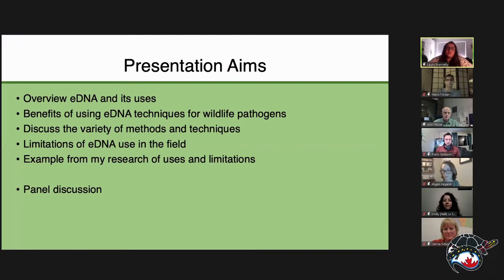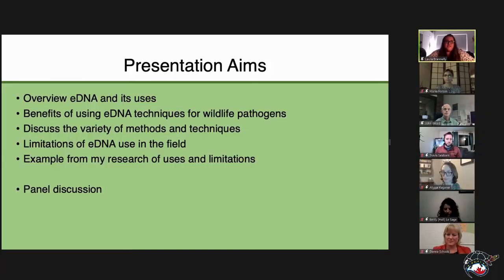Okay, so we'll overview eDNA and its uses, and the benefits of using it for wildlife pathogens. I'm going to talk mostly about amphibian pathogens and BD primarily, but the techniques can be widely used for a number of different organisms and pathogens. And we'll discuss the methods and the techniques that are important to consider when you're designing eDNA work, and also the limitations of eDNA use in the field. And then I'll use an example of my research of the uses and its limitations for amphibian pathogens.